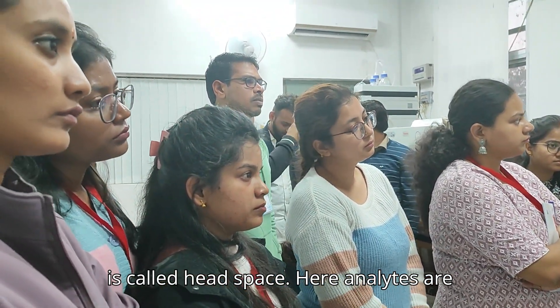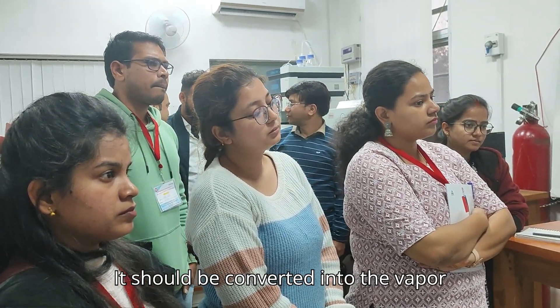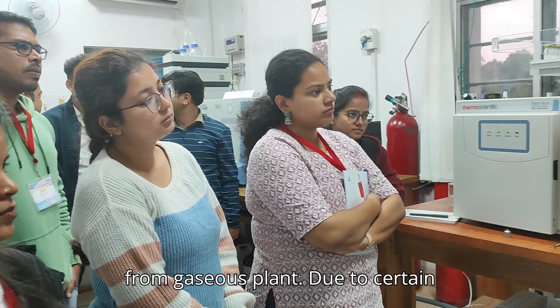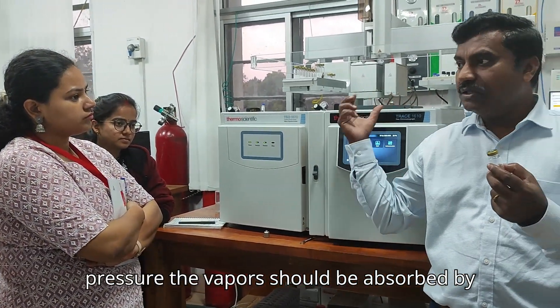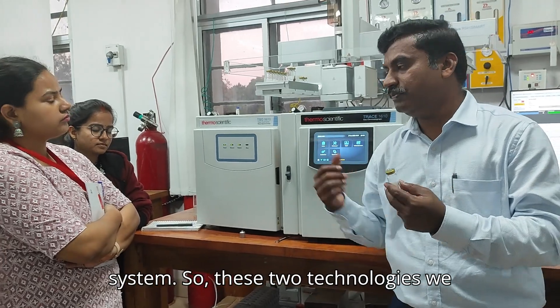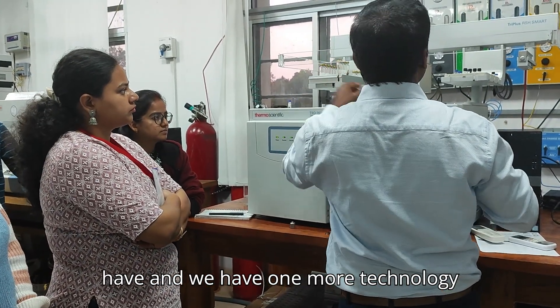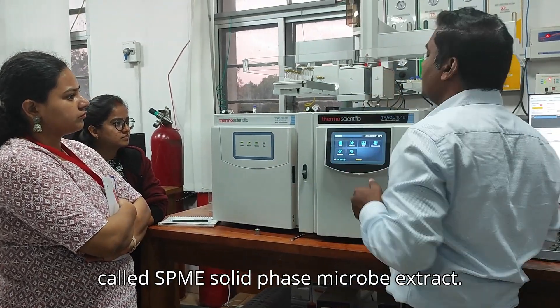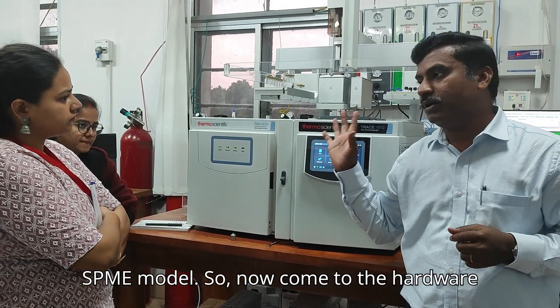So these two technologies we have — liquid injection and headspace. We also have one more technology: SPME — Solid Phase Micro Extraction. That's a different technology. I will show you when we are performing the SPME module.